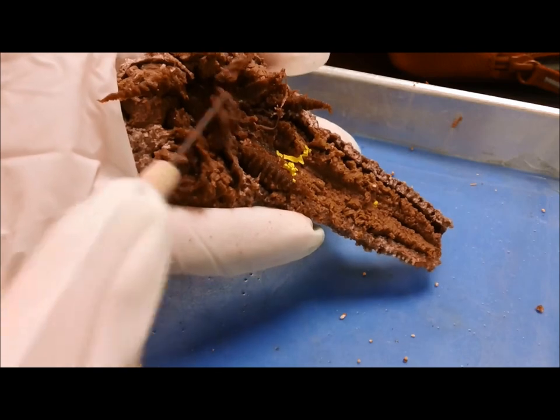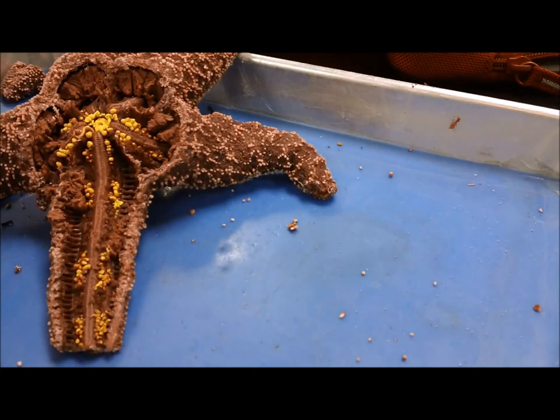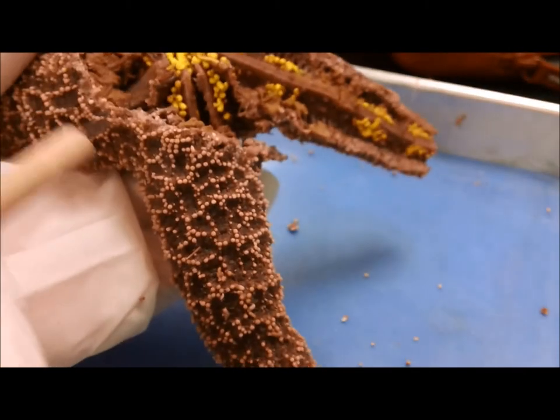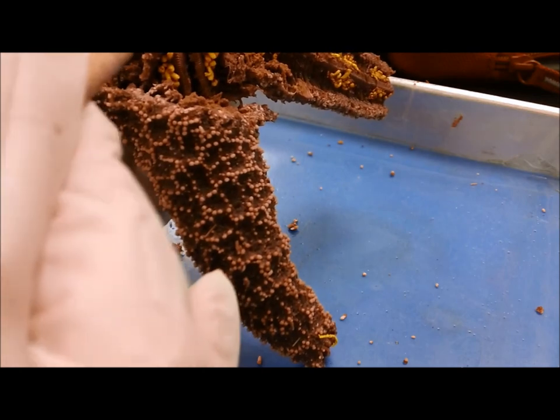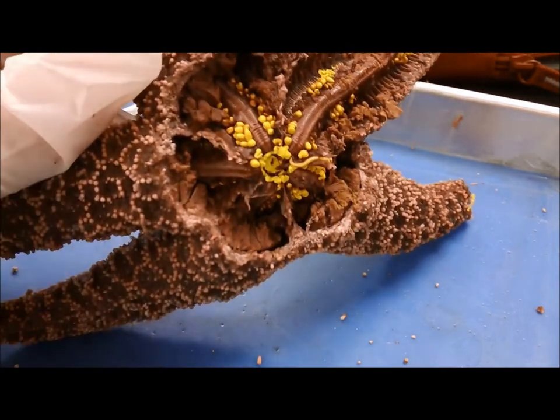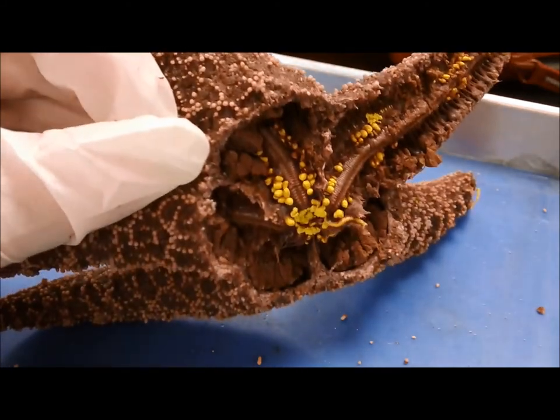I don't know if you can really make it out. This is the part that it can kind of push through here. You can see the ampulla — now I split that radial canal and kind of broke it up a little bit. But you can see the ampulla here, and these are going to work with the tube feet to control how much water is coming in and out through the tube feet, because they can act like little suction cups. You can think of them as like the bulb at the top of an eyedropper.